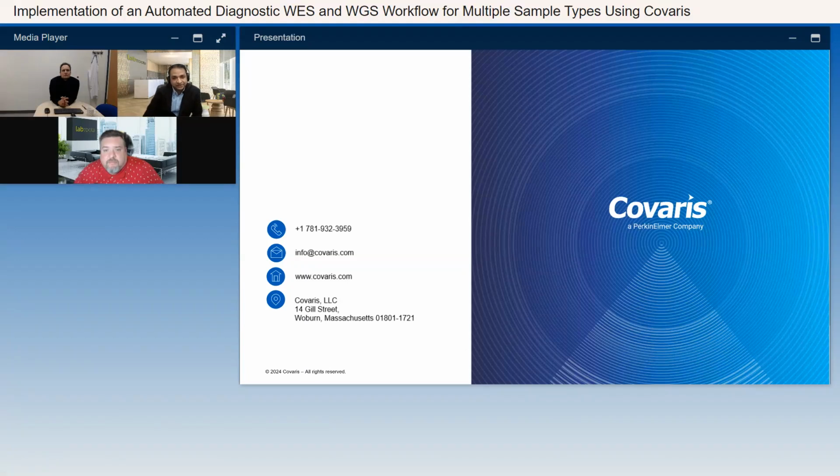Can you comment on how difficult it is to integrate the R230 Covaris instrument into the Hamilton liquid handler? Yeah, I can comment on that. Of course, you need some experts from Hamilton to implement it next to your instrument. So you need to have an extra driver to address the correct commands to the Covaris.